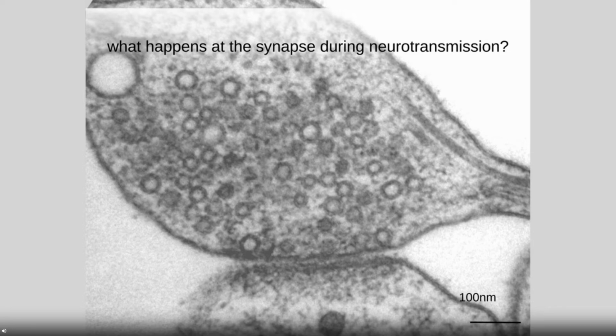So in the Watanabe lab, we're very interested in synaptic cell biology. And so Shigeki already showed you an example of this beautiful structure that we see. Just looking at a synapse, you can understand why this is a structure that is traditionally in the domain of electron microscopy, and that's really just because everything is very, very small. Here, the entire presynaptic terminal is only about a micron across. Synaptic vesicles are 40 nanometers in diameter and tightly packed together. And all these fine structures of synapses, vesicles getting close to the active zone, vesicles fusing, things endocytosing in the presynapse, all this is at a nanometer scale, really only accessible to electron microscopy under most conditions.